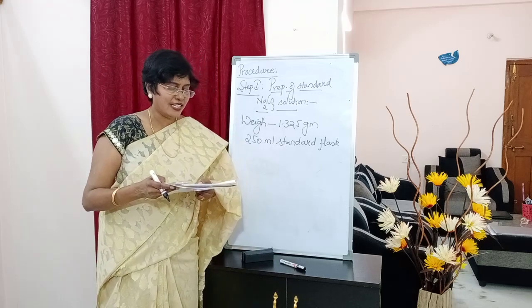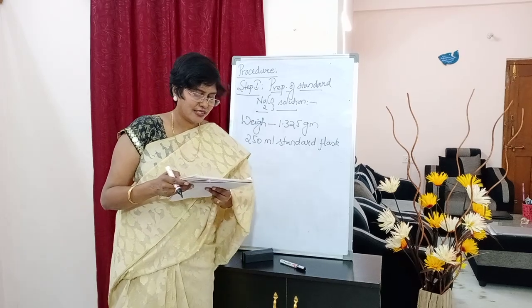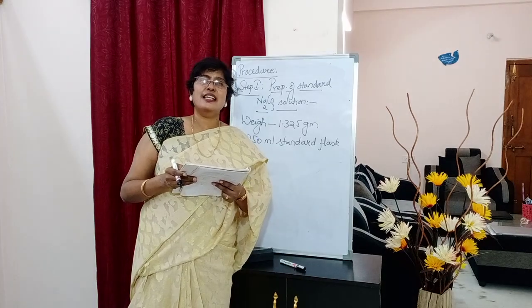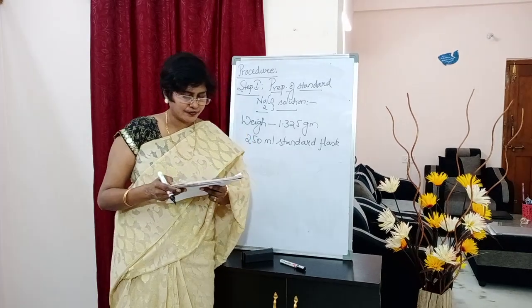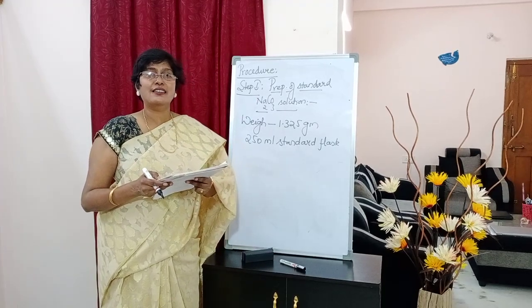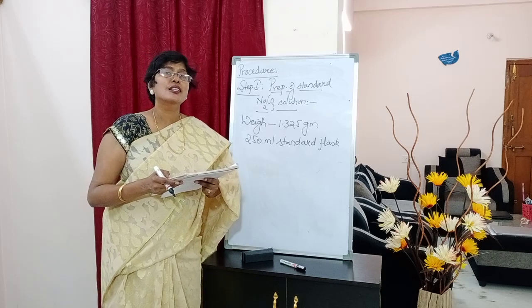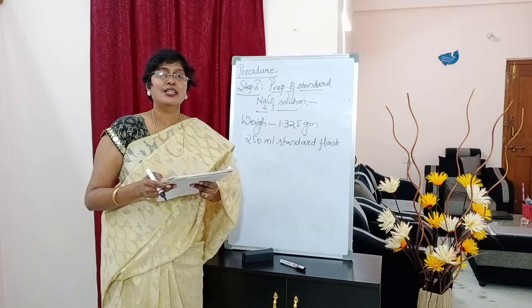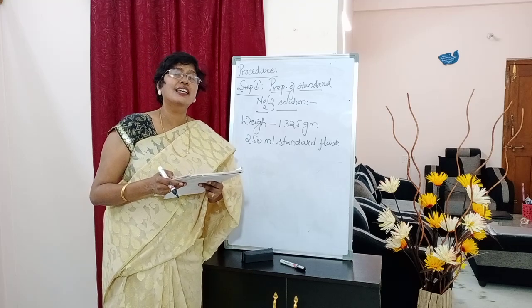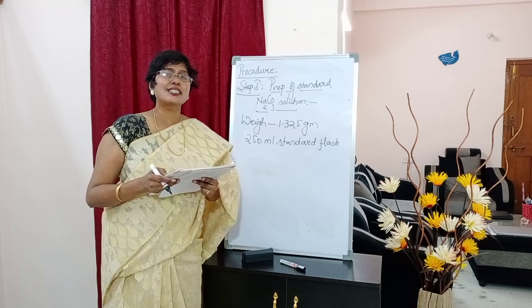and calculate the molarity of Na2CO3. Calculate the molarity of Na2CO3. Okay. So here we will be finding the concentration of Na2CO3. Okay. So that is your first step, students.